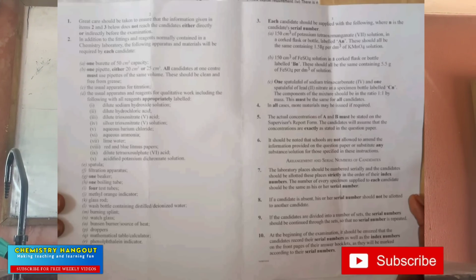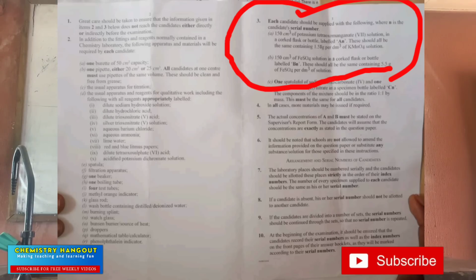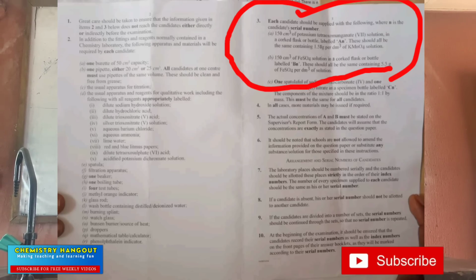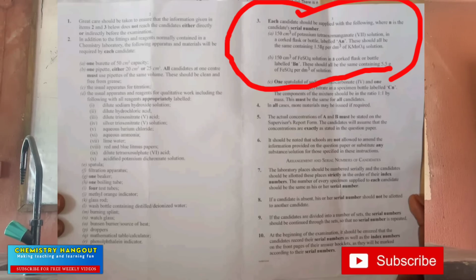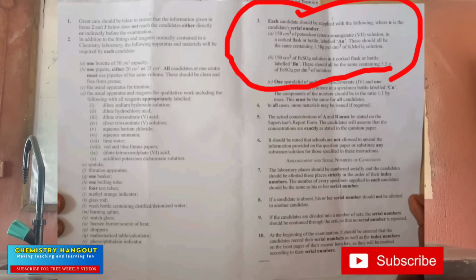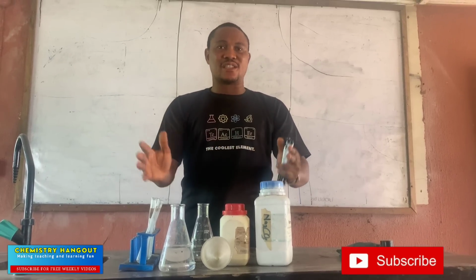If you check the instruction, you're going to see permanganate solution, that's potassium permanganate, KMnO4, and iron(II) sulfate, that's FeSO4. If you look at that particular instruction, there is a particular measurement you have to make. Let me talk to teachers now. For permanganate, you have 1.58 grams in 1 dm cube of the solution, according to the instruction. And for iron(II) sulfate, you have the mass there too. I want to believe that as teachers, we know how to prepare this. It's a very simple preparation anyway.